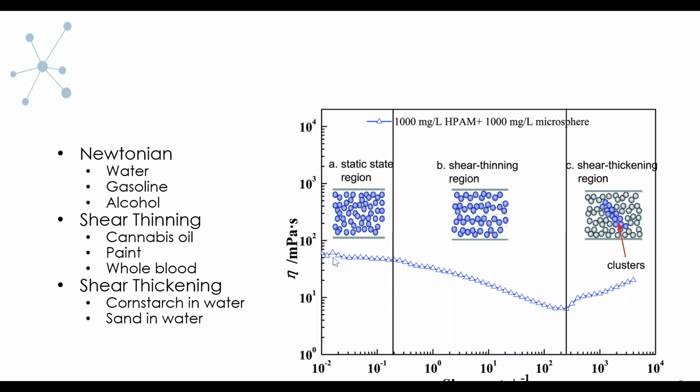However, as the shear rate is increasing, the molecules begin to line up. In the case of shear thinning samples or fluids, this lining up allows the different molecules to basically slide over each other. And this sliding action is reflected as shear thinning.